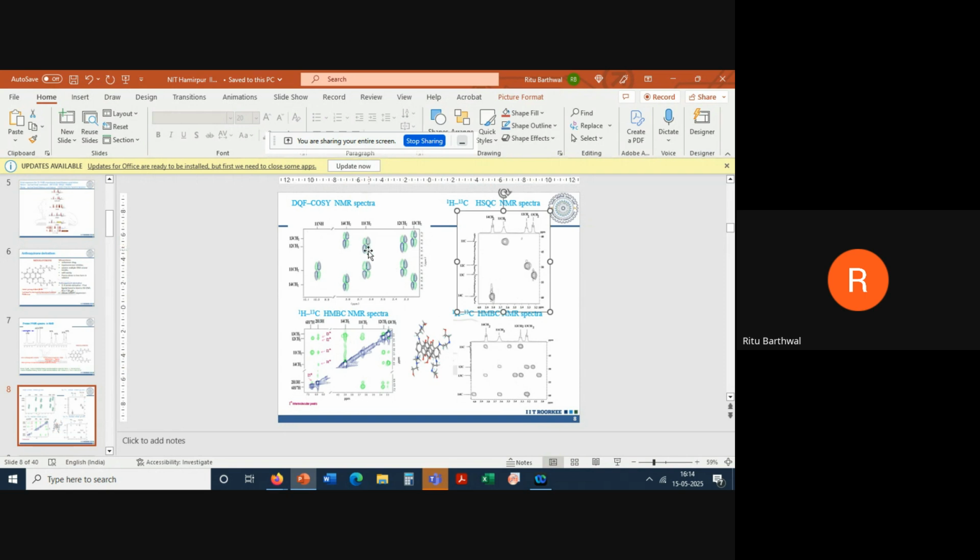This is nothing, as I told you, it's the same resonance peak, because here on you will see them as this only in my spectra. This is a resonance line as you observe in OD or fluorescence. Imagine that it is cut from somewhere in the middle, then it will show you a contour. So this is that contour. All these contours that you see is actually a peak.